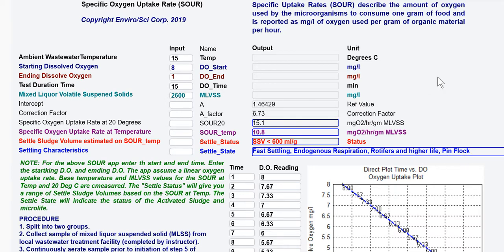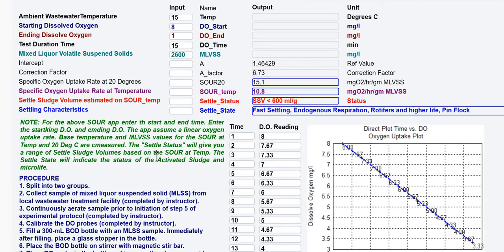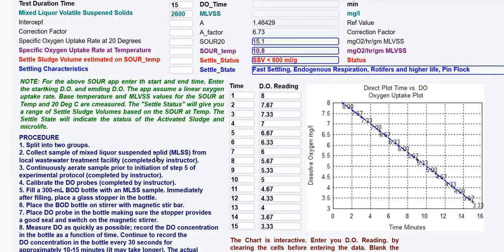With this application you are able to get an indication of what you should be looking for in a settled sludge volume and the characteristics of the sludge based on the oxygen uptake rate. You can change the temperatures and the start and ending values. This part of the application assumes a linear consumption of dissolved oxygen.